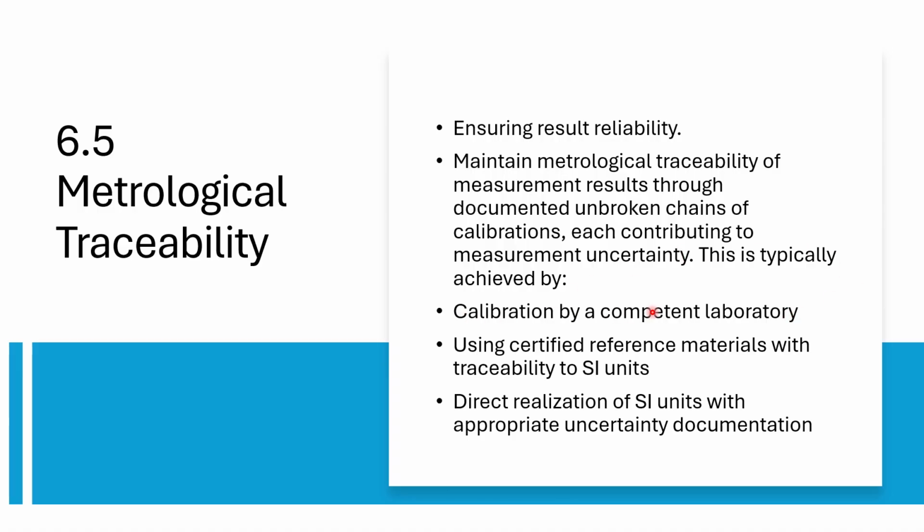This is typically achieved by calibration by a competent laboratory, using certified reference material with traceability to SI units, or direct realization of SI units with appropriate uncertainty documentation.